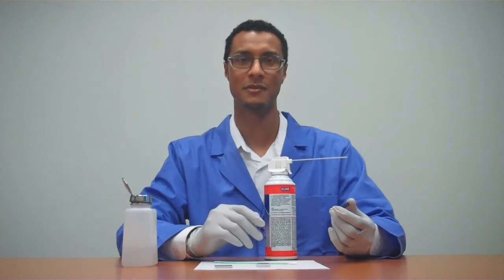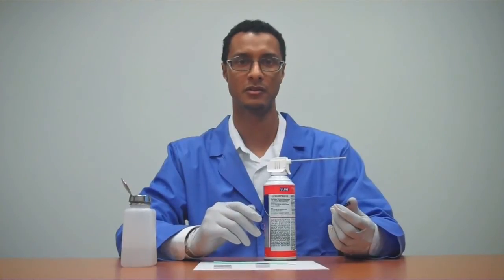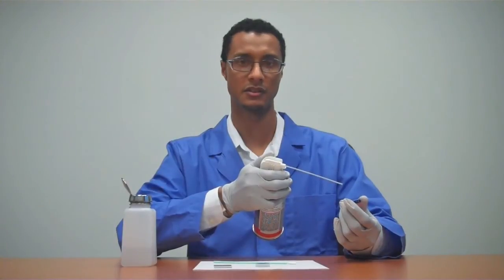Many loose contaminants can be blown off using compressed air. Using gentle to moderate air flow, first point the airstream away from the filter, moving it across the filter surface.